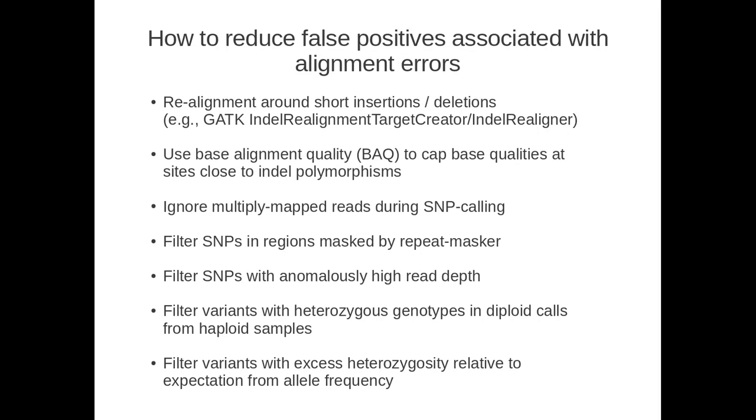It's more just to begin to familiarize you with some of the problems in our field and the analysis difficulties that those of us who are working with the raw data are trying our best to overcome, to generate high quality SNP data sets that allow us to draw conclusions about the biology or whatever question we're trying to address.